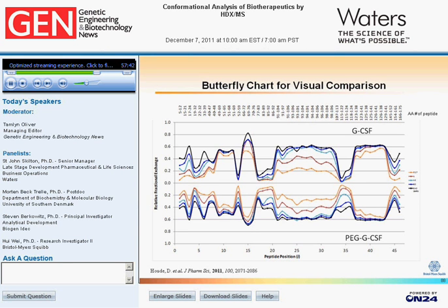Briefly, the chart is a mirror plot with GCSF on the top as a reference and the pegylated GCSF on the bottom. The y-axis is the relative fractional exchange, and the x-axis is the peptide position ranked by the midpoint of the peptide in the protein sequence. The different colored curves represent the relative deuterium level at each individual time point. From this plot, one can easily compare the relative deuterium incorporation at peptide level across the entire polypeptide backbone with spatial and temporal information. Next slide.